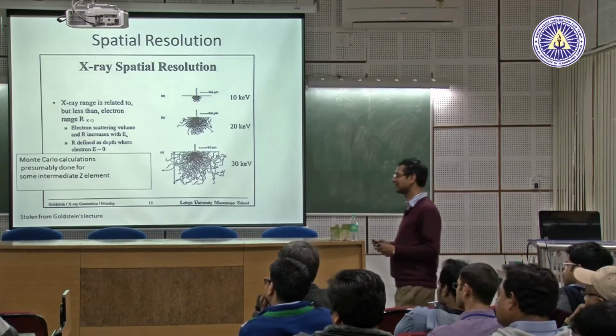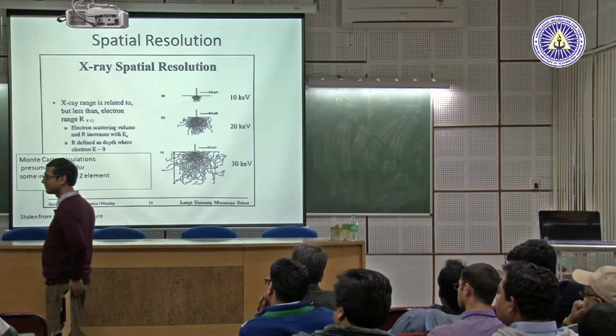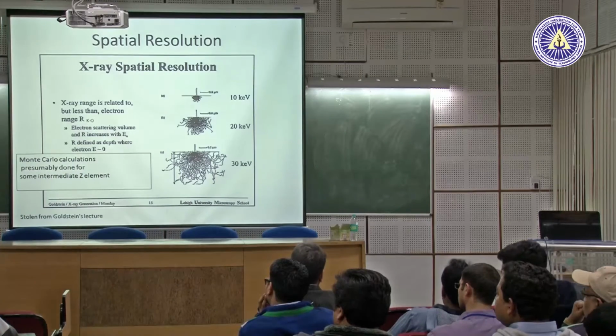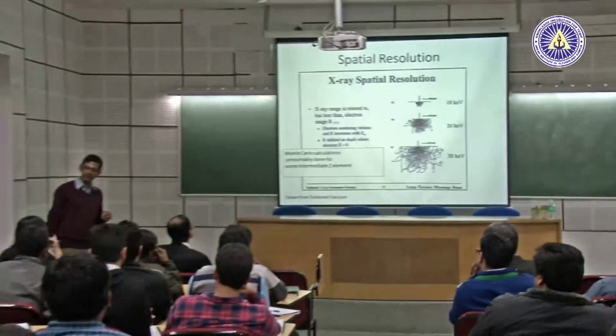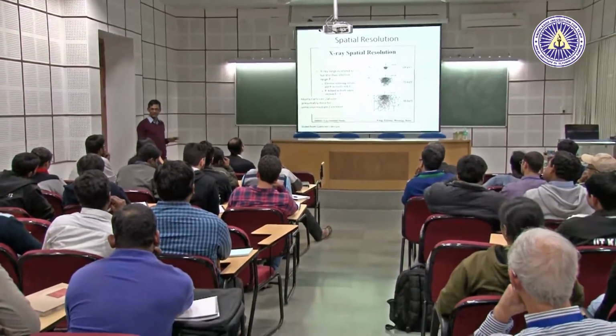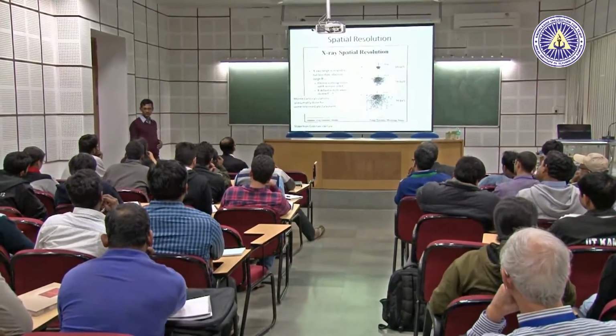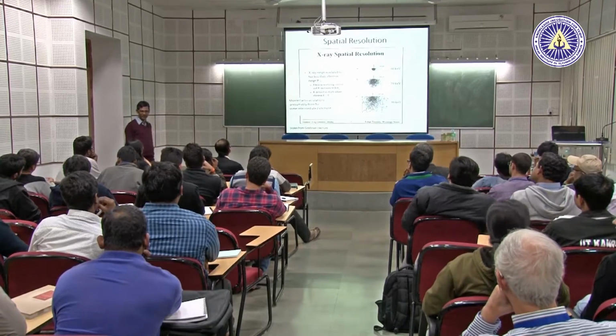In case we have low amounts of maybe carbon or oxygen, how reliable is the SEM EDX data? Yeah, carbon is reliable. Actually you can go down to carbon. Below that, it's not reliable. Carbon, even if we have small quantities, it will still detect and give information.